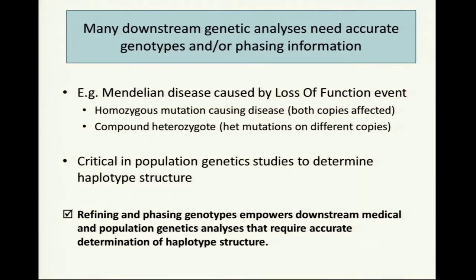genotypes. So particularly in low-pass sequencing, where your genotype likelihoods can be fairly broad because you only have maybe one or two observations of a variant, you can use an individual's genotypes with respect to everybody else that you sequence as part of that study to assess what really is the likelihood of a genotype at this particular site, given not just the reads at that site, but all of the reads in a large context, simply by looking at the likelihoods of other variants and how often heterozygotes or homozygotes at different sites co-occur within individuals.